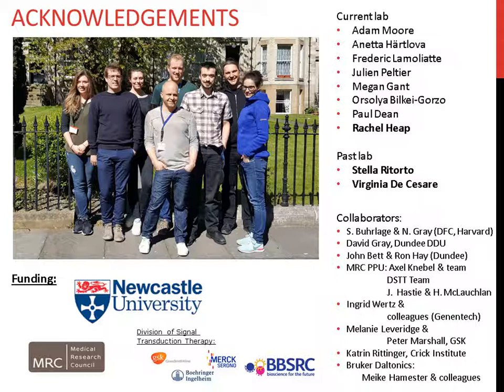Thank you very much. The next question is, which buffer components affect MALDI-TOF analysis? So this is a constant discussion we have. Most of the biochemists we speak to are using buffers that have been used since the 50s. And in many cases, there are buffer components in there that will affect MALDI mass spectrometry.